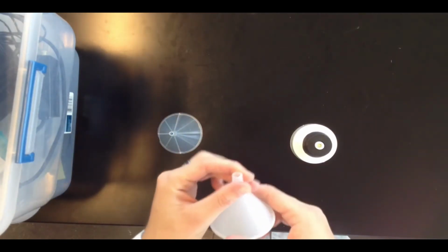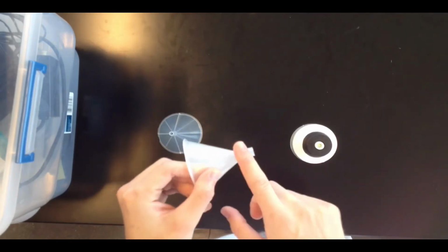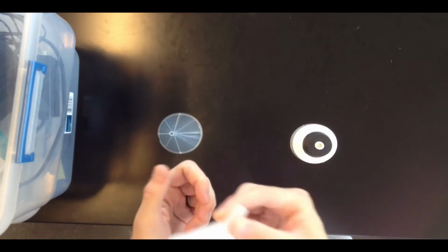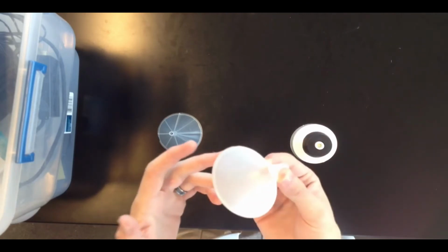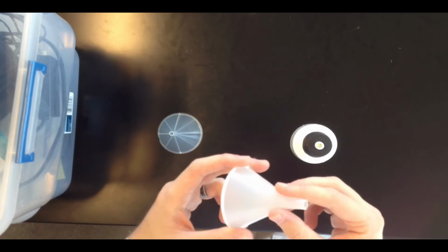Similar to the burette funnel, but with a wider opening on the bottom, is the powder funnel. Powder funnels can be used to transfer solids or liquids. The advantage of the wider mouth is that solids won't clog up the bottom of the funnel, and so you can use this, for example, when you're transferring solids into a volumetric flask for solution preparation.